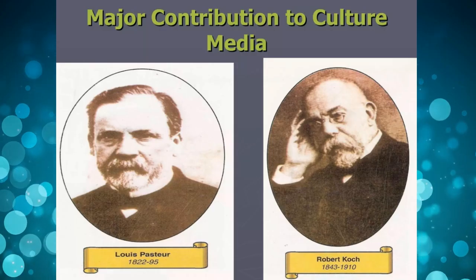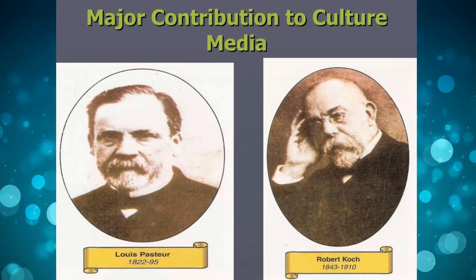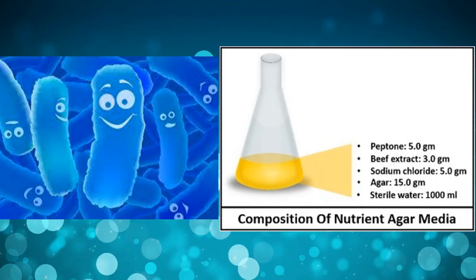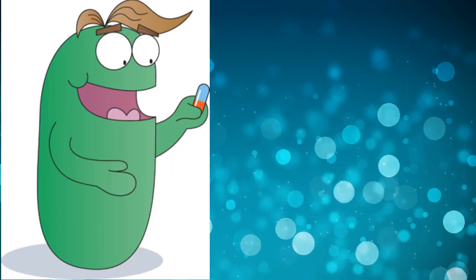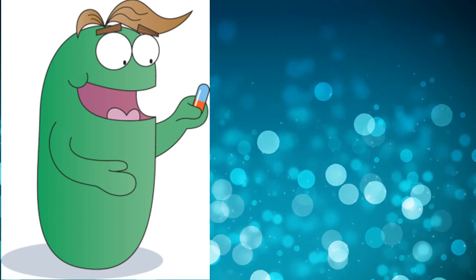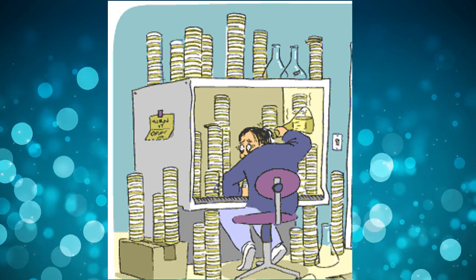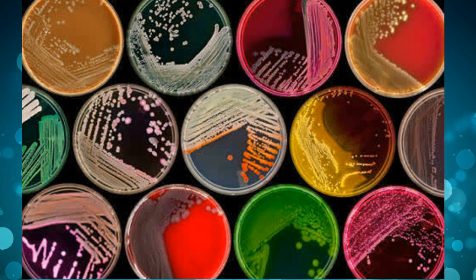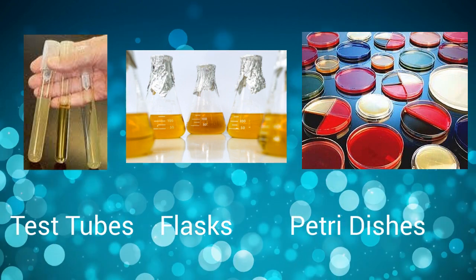Development of artificial media was the milestone achieved in the late 1800s that gave a major stimulus to the rise of microbiology. For a successful culture, the artificial media must provide all growth requirements of a particular pathogen. The requirements of different bacteria vary from a few inorganic compounds to a complex list of inorganic and organic compounds. That is why we have over 500 different types of media being used for culturing and identifying different types of microbes. Culture media can be kept in a test tube, flask, or petri dishes.